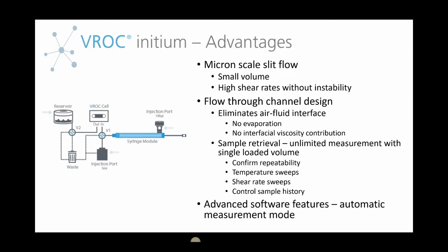And because we're looking at microfluidics, when we go, as you'll see, some of our data is taken at shear rates above 100,000 reciprocal seconds. We have no concerns about any sort of hydrodynamic instabilities because of the microfluidics.